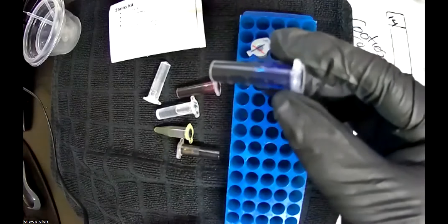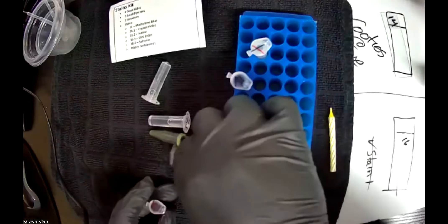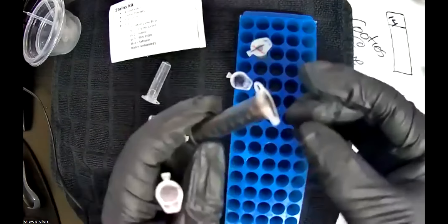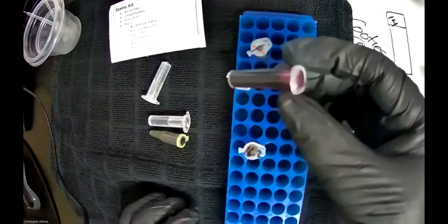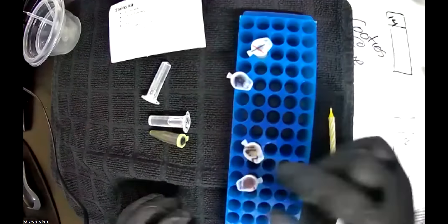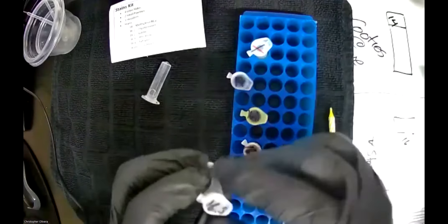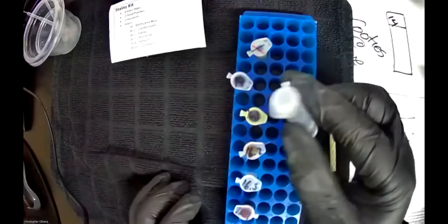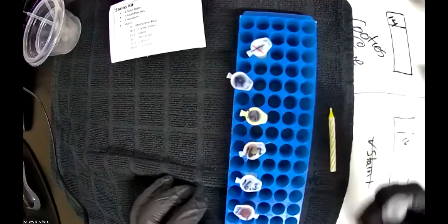Here's all your stuff. For example, this one says '14' — it might not come out as clear as yours, but you should be able to tell it's a deep blue — this is your methylene blue for lab 14. As you go through all of these, you'll see labels: this one says '16.2' — that's your iodine, you can also tell by its copperish-brownish color. This is your safranin with a deep red color. Here's crystal violet, which came in a different colored vial, and here's your ethanol labeled '16.3' — it looks like water but it's alcohol.